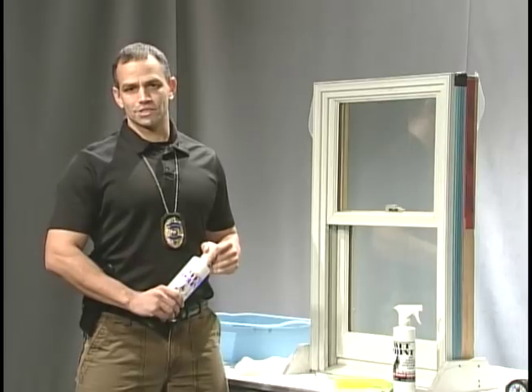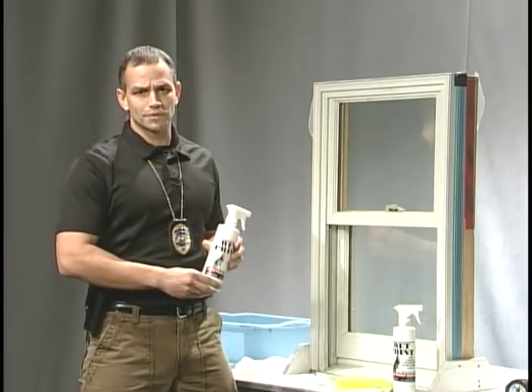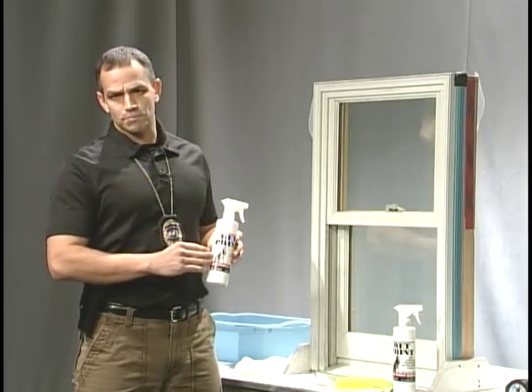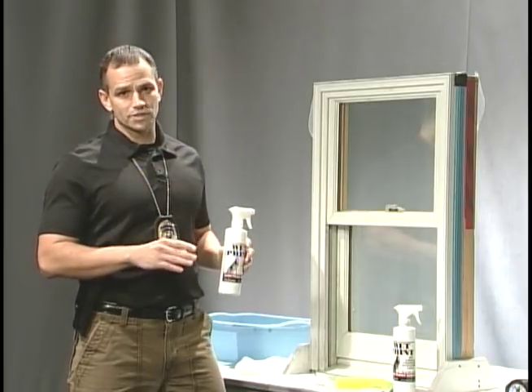Hi, welcome back to Forensic Education Series. I'm Mike McCutcheon. Today we're going to use a small particle reagent — we're going to use a product called WetPrint. The small particle reagent is going to allow us to develop fingerprints on wet surfaces.